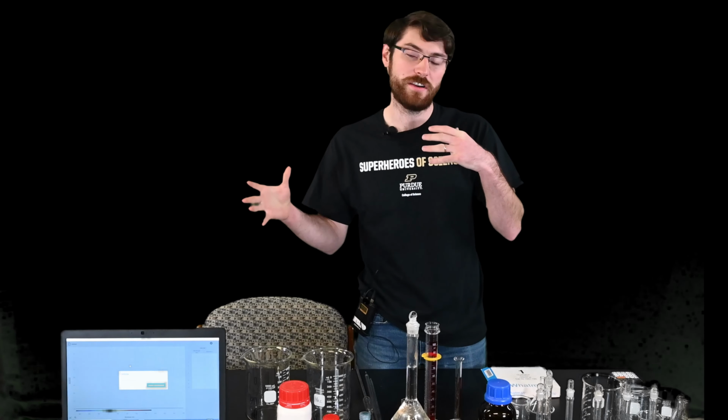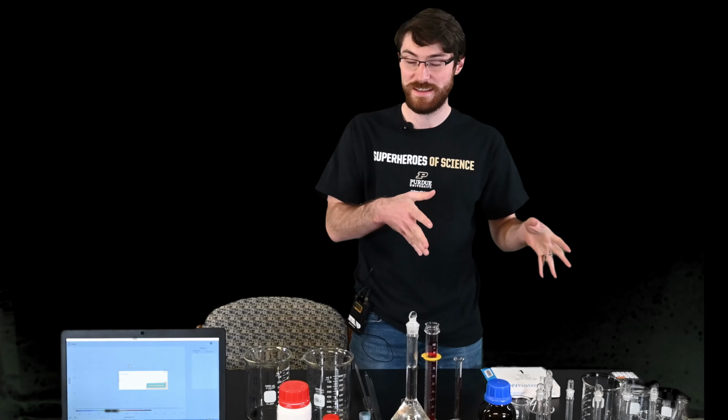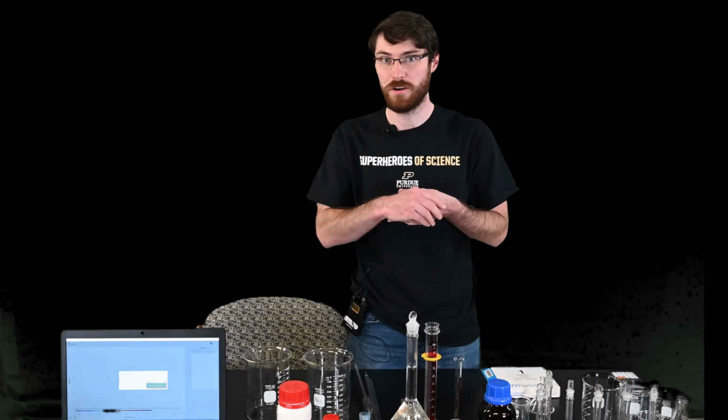Today I'm going to be walking through a procedure for the spectrophotometric determination of iron in a river water sample. Now, first of all, why do we care about the concentration of metal ions in water samples?